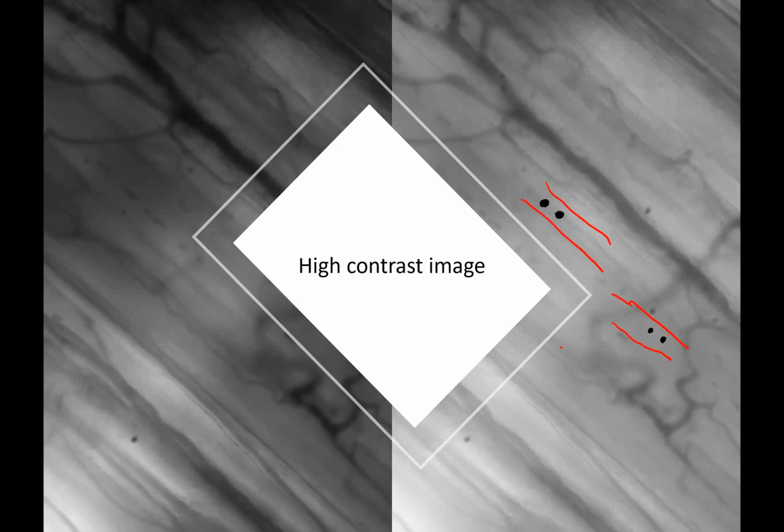The darker points are red blood cells, and they are at different positions in different frames. If we add these two frames and divide by 2, we can have a new image like this.